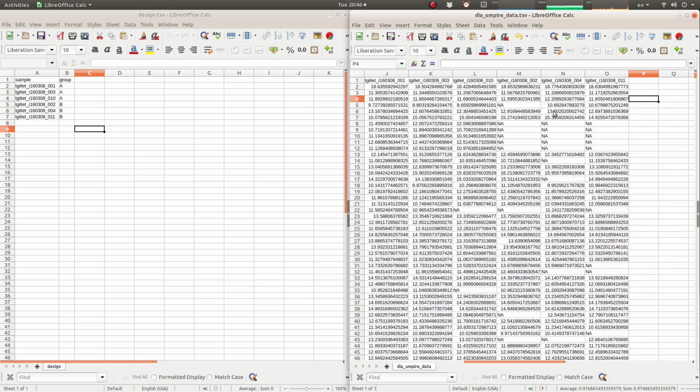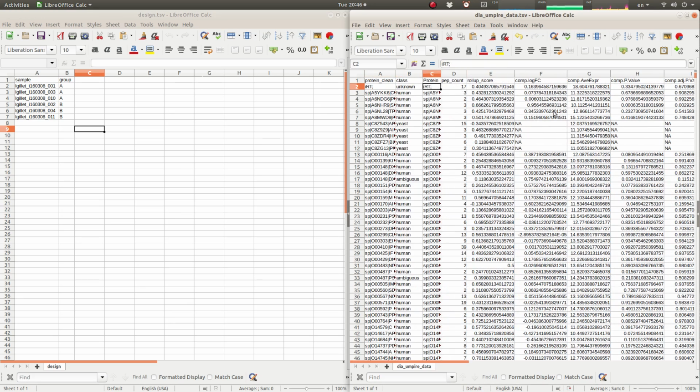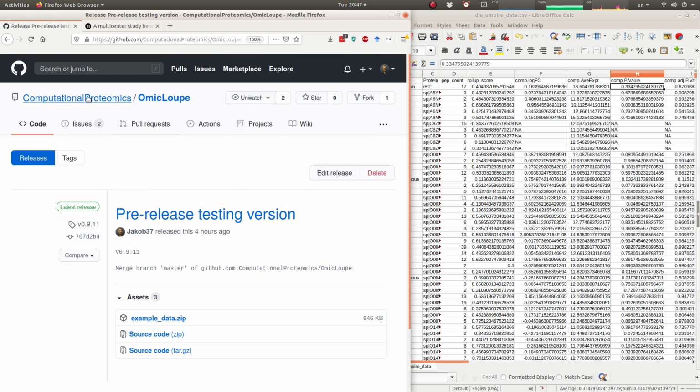And then finally we have the sample columns here. If you have data in this format and you don't know how to generate these statistical columns, you can do this with many R packages, such as the Limma package, or the DESeq2 package if you're working with RNA-seq data. If you're working with proteomics, metabolomics or microarray data, which are normally distributed, then you can use a software called NormalyzerDE.